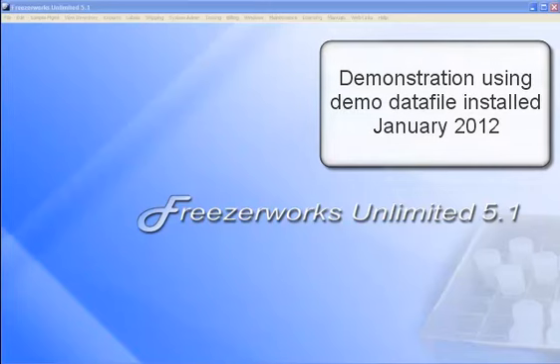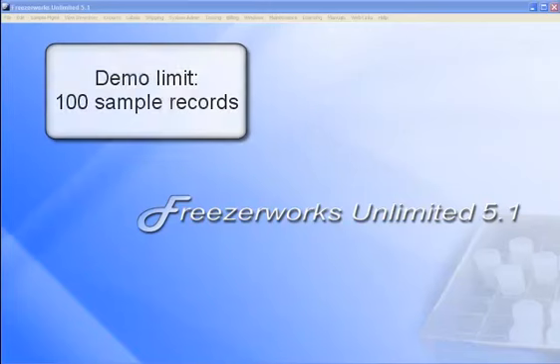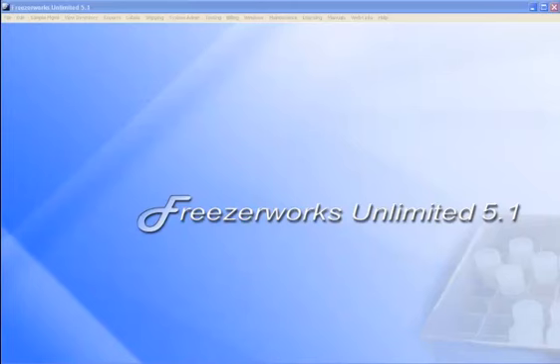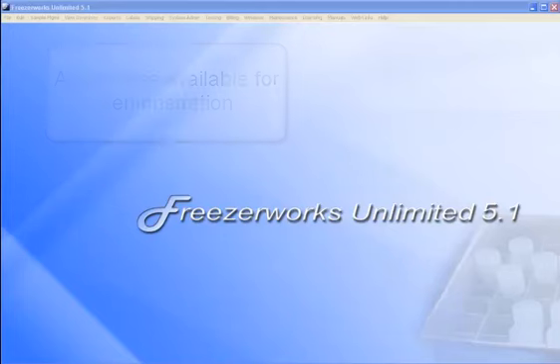It's a demonstration version. It has a 100 sample record limit. So that's the only restriction. All the features are available to you to demonstrate to potential clients. This demonstration is to help you get familiar with this demo so you can show this demonstration file, how to log in and what to look for. So let's go ahead and get started.